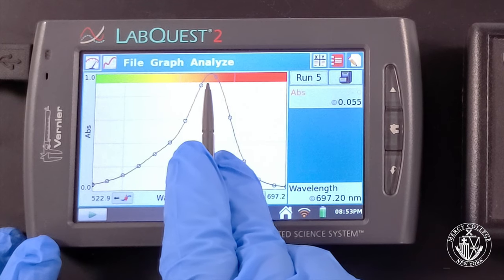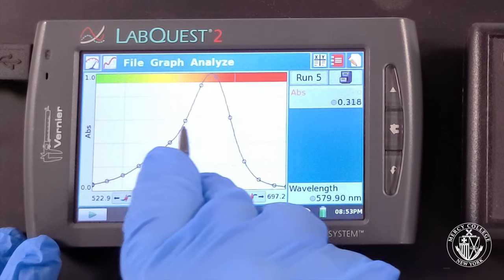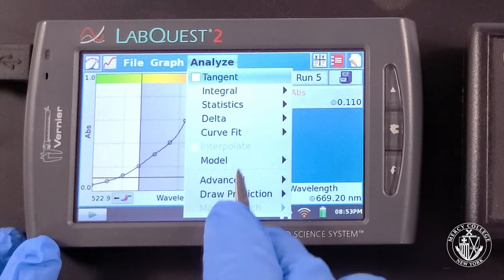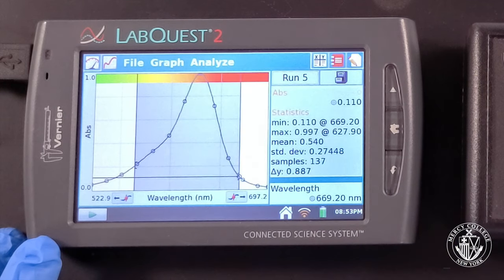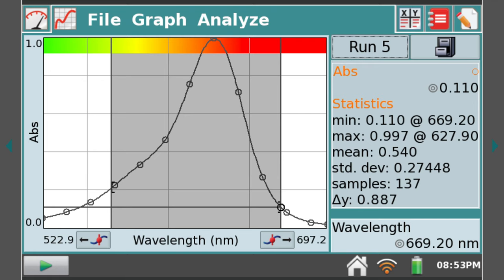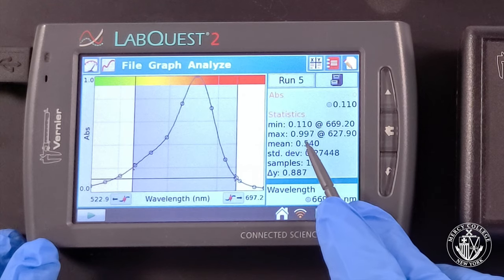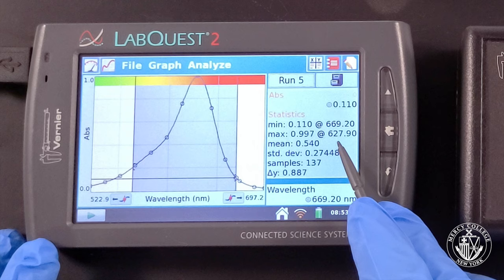This dye absorbs in the yellow-orange region of the spectrum. It appears to have an absorbance of 0.997 at a wavelength of 627.9 nanometers.